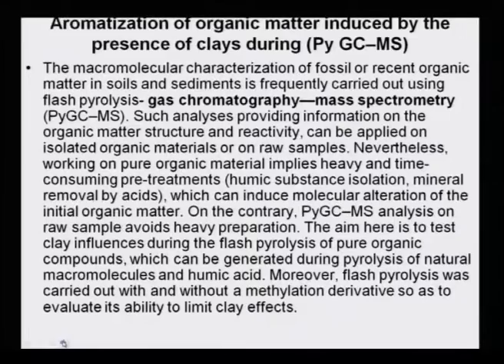The macromolecule characterization of fossils or recent organic matters in soils and sediments is frequently carried out using flash pyrolysis gas chromatography mass spectrometry, that is PY-GCMS.